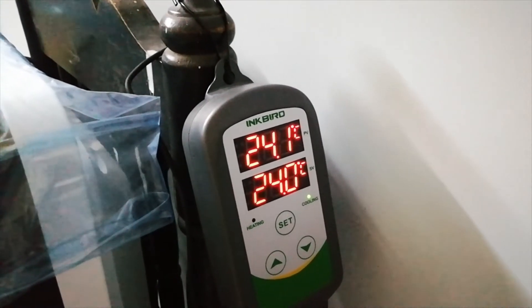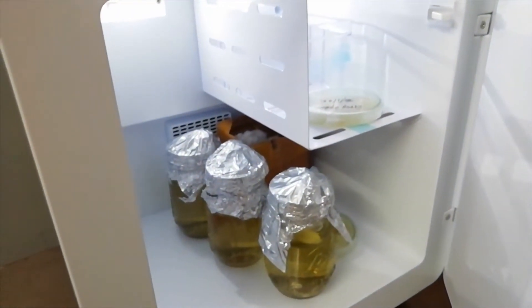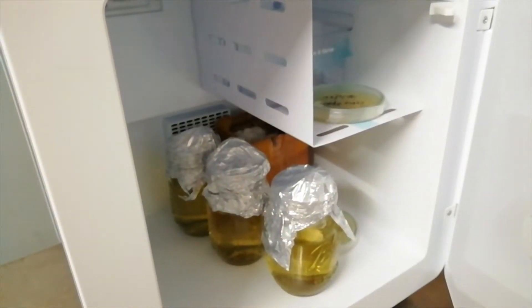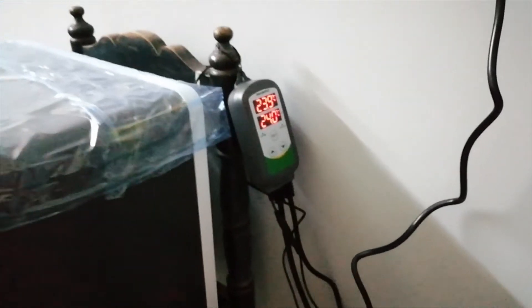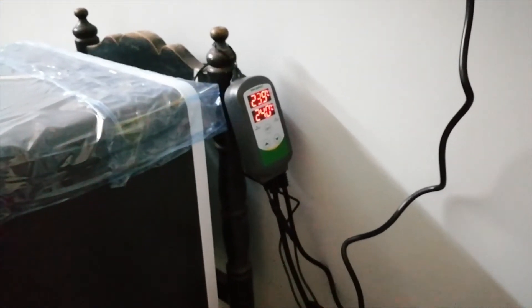When the temperature comes back down to 24 degrees Celsius, the fridge will switch off automatically. This is my small experiment — commercial incubators are a bit expensive and come with CO2 and humidity controls as well.